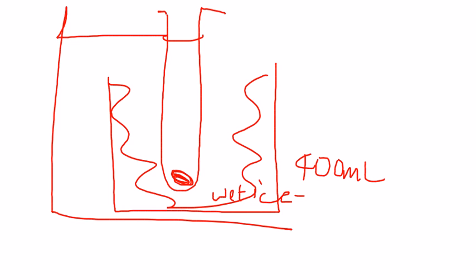You're going to put, like I said, 4 milliliters of propanol. So that's my nucleophile already in place. We are cooling it because as we go through the reaction, this is an exothermic reaction. So if you don't cool the reaction in the beginning, the reaction can get heated up quite a bit, and the boiling point of your acetyl chloride is only like 51 or 52 degrees Celsius. And so you're going to lose a lot of material because the reaction generated a lot of heat, and so you're going to lose a lot of reactant. If the reactant is not there, obviously the reaction is not going to go through, and you will still see the alcoholic peak at the end of the day. So that is the reason why we want to cool it for about 10 minutes.